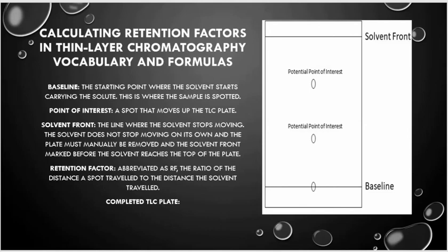Then we have the solvent front. The solvent front is the very topmost line till which the solvent kept moving. The retention factor, abbreviated as RF, is the ratio of the distance the spot travels to the distance the solvent travels. This is a picture, or a view, of a TLC plate.